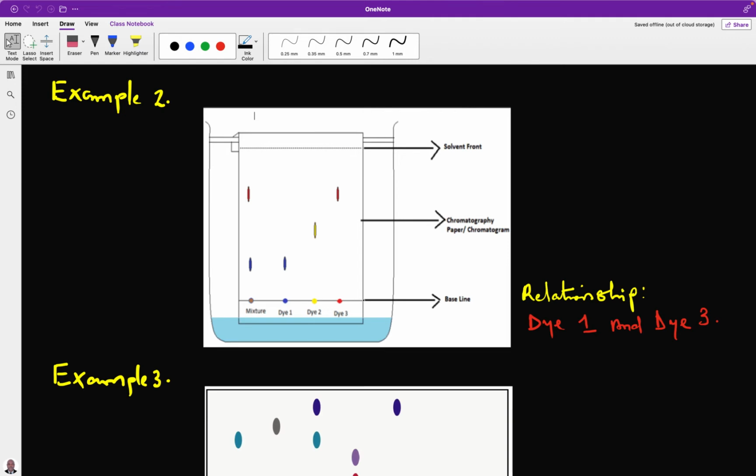Remember, I said it is recommended to use pencil, not pen, because a pen contains many colors. Blue, yellow, and red pens, apart from white, are all mixtures of other colors. White signifies purity, but any other color or dye is a combination of other colors.